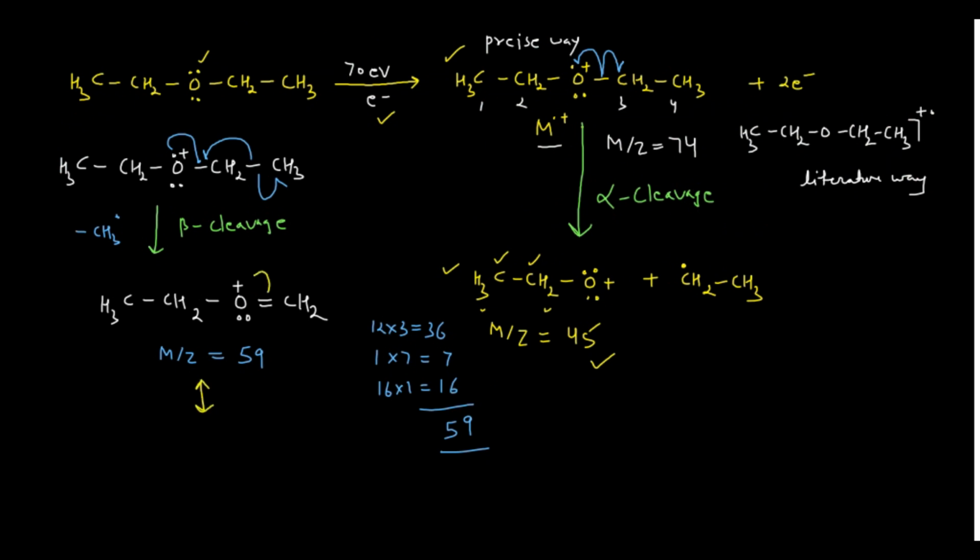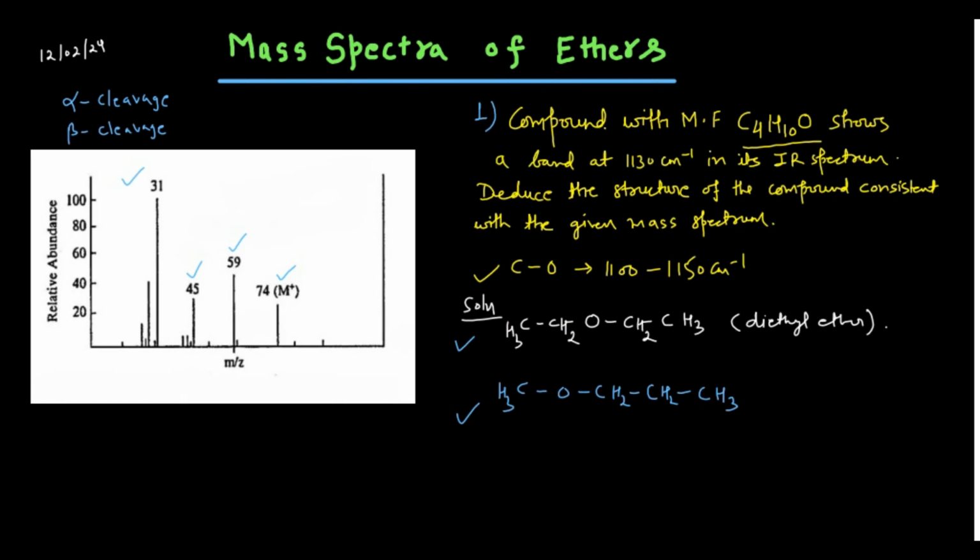The electron pair can come here, and then you end up with another structure, which would be your CH3, CH2, O with two full lone pairs on it, and CH2 positive, right? Since this is resonance stabilized, you can see its intensity is also quite good. It is more than the molecular ion, and more than the fragment giving the m/z value at 45.